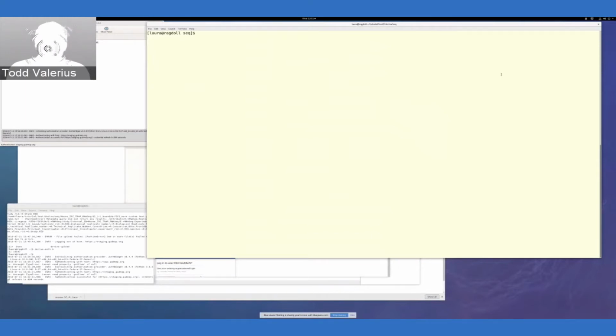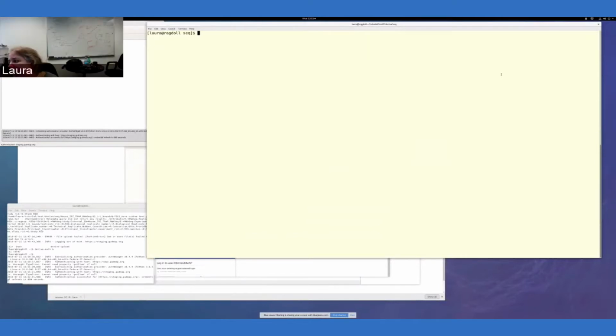And then what you're describing to us here is that we're authenticating to our GUDMAP or RBK server. And then we also need a way for the bioinformatics server, say, to authenticate so that we can connect these two directly instead of downloading locally to our computer and then uploading to the GUDMAP or RBK. Right, exactly. And this is especially something you would want to do if you have really large files, because the download and upload is just a ridiculous thing to have to do.